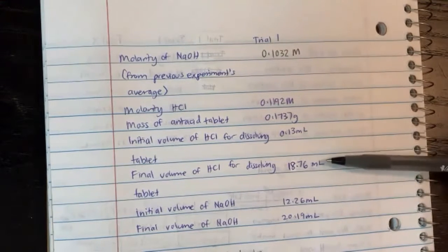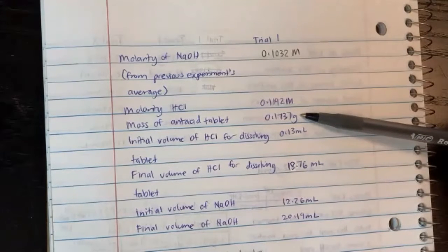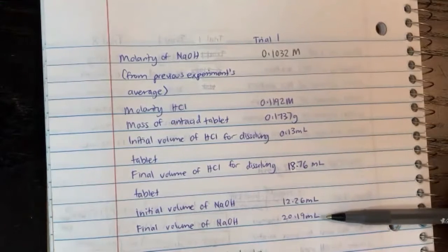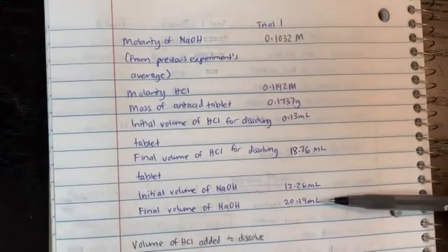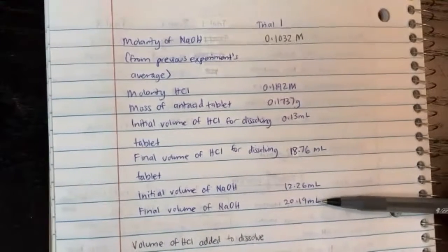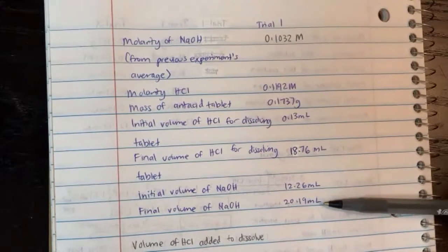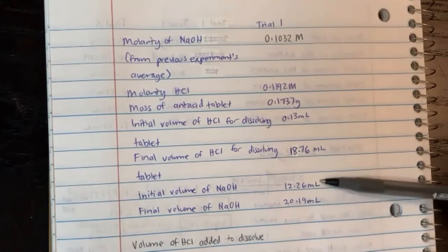After you cook the HCl antacid a little bit, you heat it up a little bit, and then you cool it back down to room temperature, and you will titrate with the sodium hydroxide. The volume of sodium hydroxide you used here is basically, initially, they had 12.26 milliliters, so they didn't fill the burette all the way up to 0. That's okay. And then you have 20.19 milliliters as the final. So from here, you can find the volume of sodium hydroxide used as well.